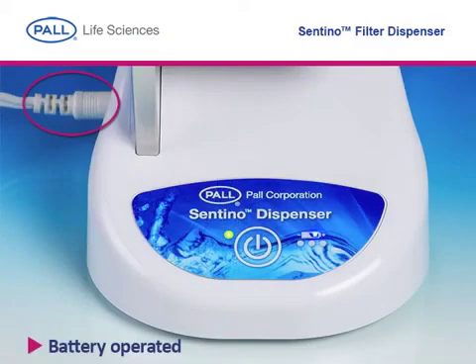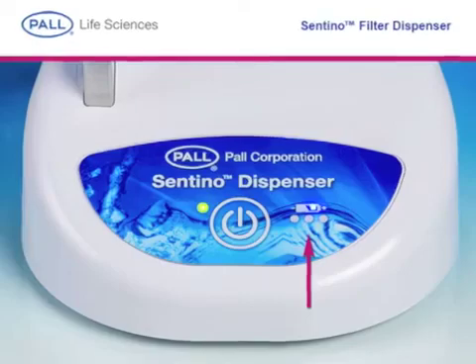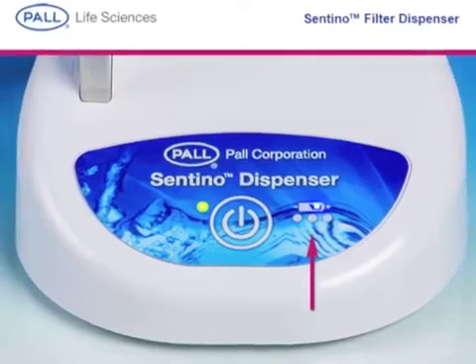Use the dispenser plugged into main power or charge the battery for a portable option in your workspace. The battery charge indicators will let you know when the battery is running low.